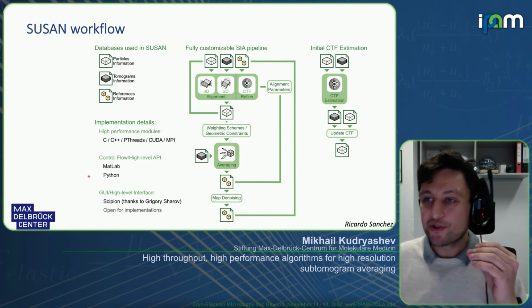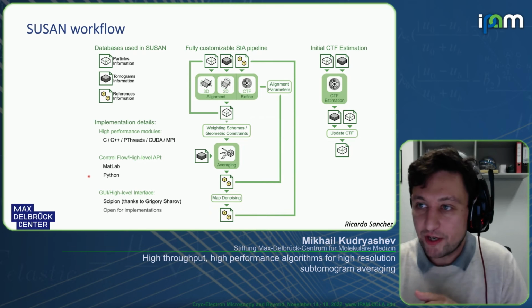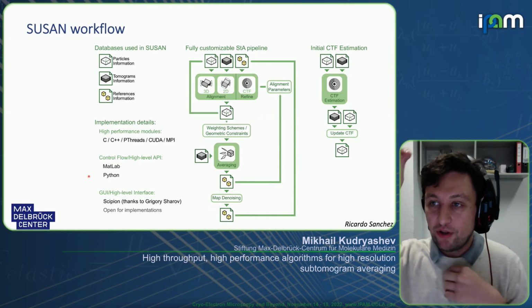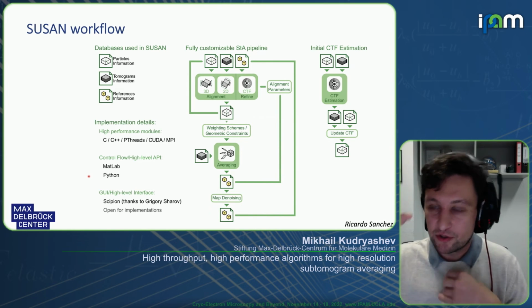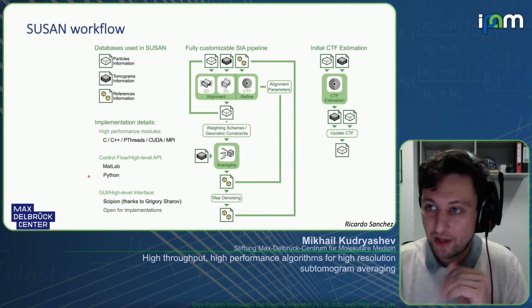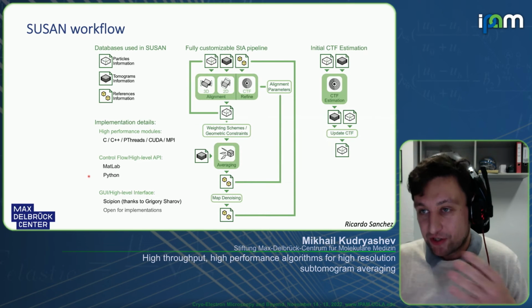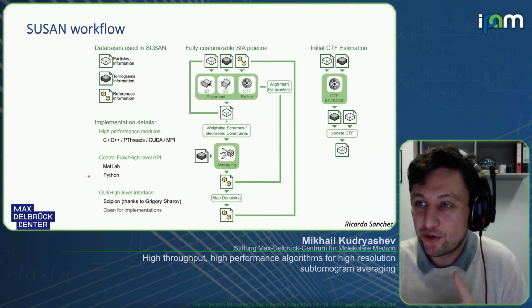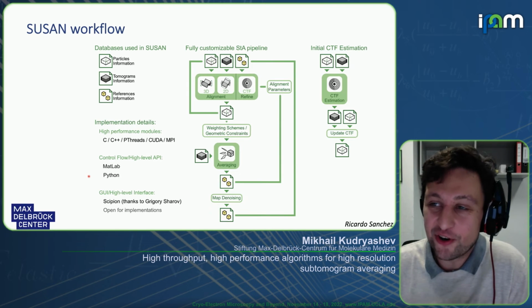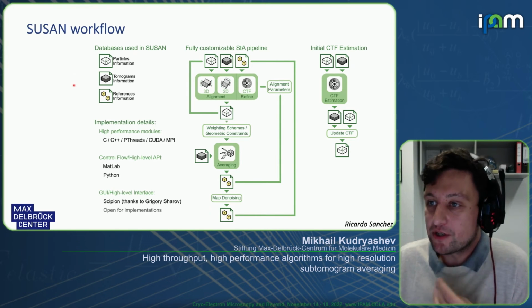Every time he performs subtomogram averaging, he loads the entire tilt series into memory, which modern day GPUs allow you to do. And then on the fly, he extracts the patches, the substacks that correspond to particles, and then he performs the alignment of those. This way you don't need to store anything on a hard drive other than those little updated databases.